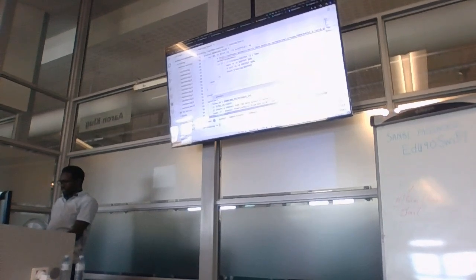Again, keyword process, and then the name. How do you want us to call it? Process fastp, right? Yeah, or fastp run.